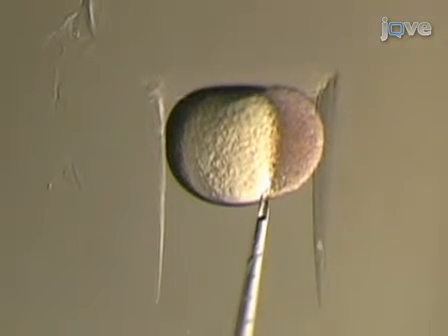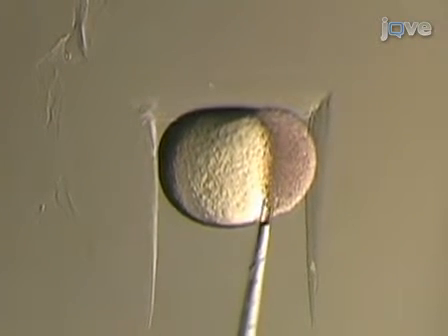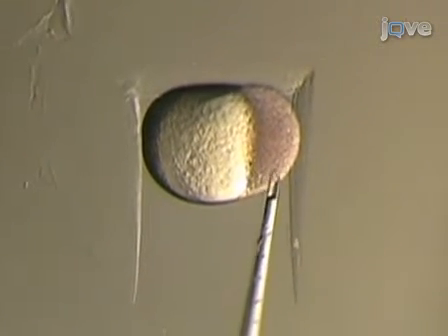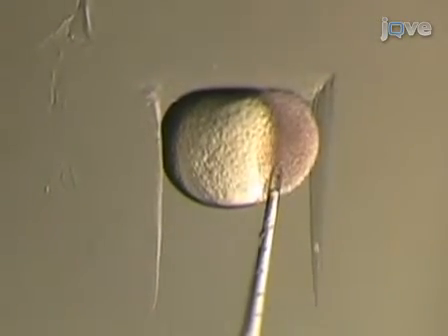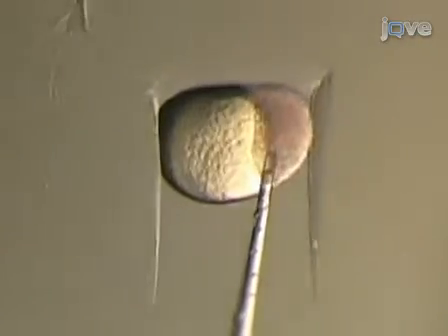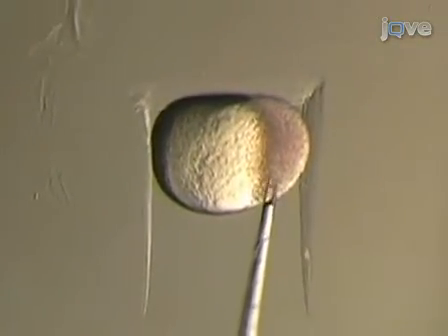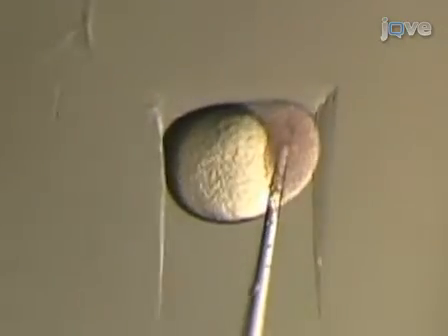For the most precise control, the interface between the mineral oil and the embryo medium should remain in the thin, tapered part of the needle, not too close to the end. Gently position the donor embryo with the needle, and then draw the needle back and enter the blastula cap of the embryo at the desired position. A swift, hard hit will penetrate the embryo without causing it to roll.